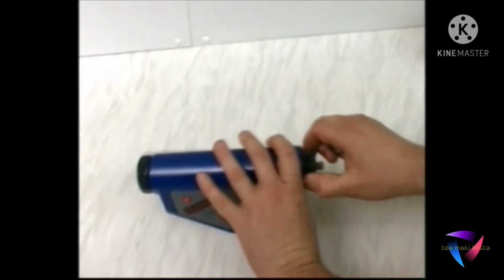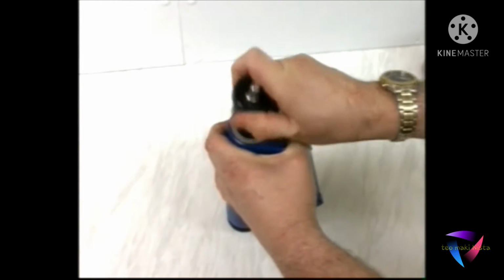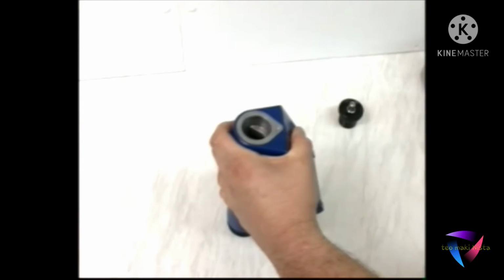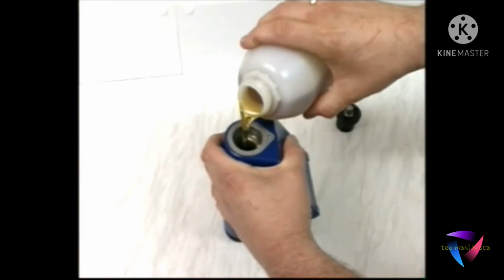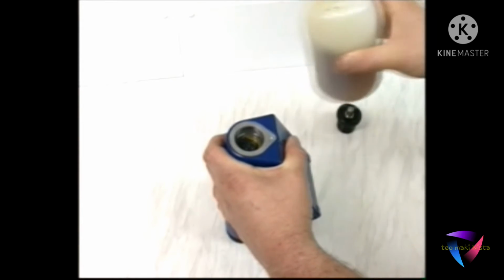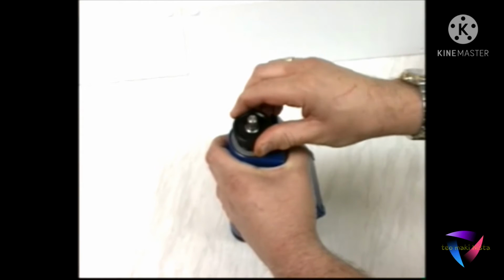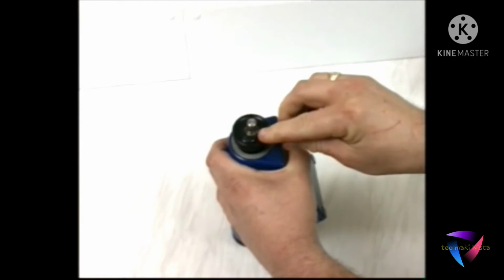To fill, hold the viscometer on its end, loosen the valve, and remove the plug from the tube. Make sure the tube is clear and clean and contains the metal ball. Fill it with the oil sample to just above the V-plate. With the valve still open, push the plug in gently until any remaining air is gone, then tighten the valve and wipe away any excess oil.